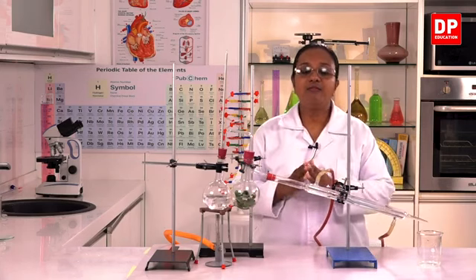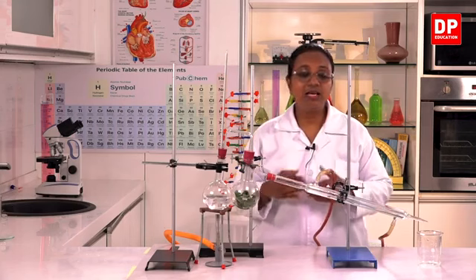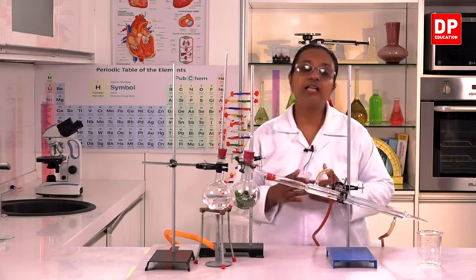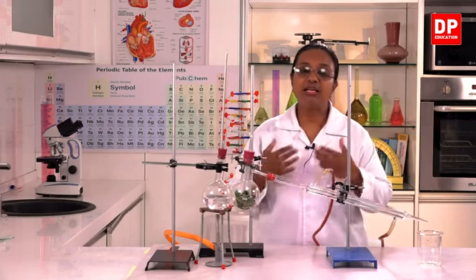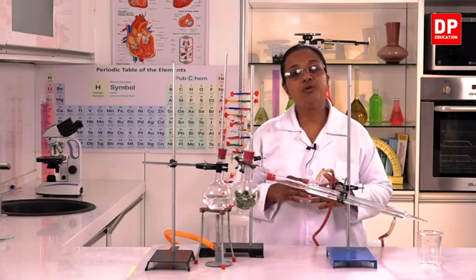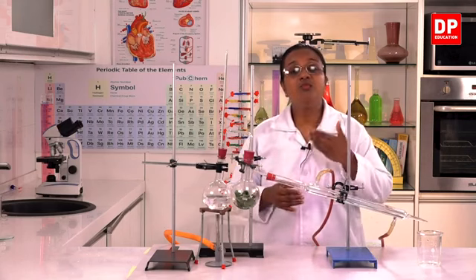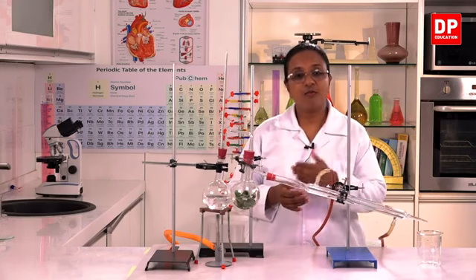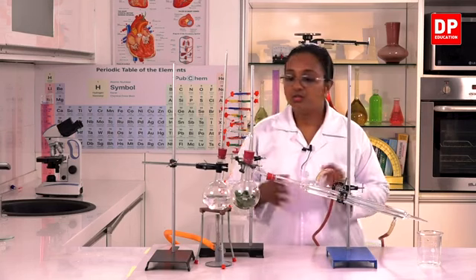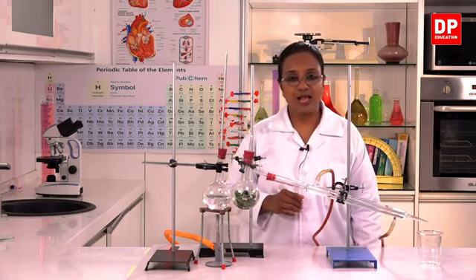So here we have to remember, students, that the cinnamon oil becomes vapor because of its high volatility. It's a highly volatile compound, so that means it can vaporize quickly and can be extracted. So as you already know, this process of steam distillation is based on the volatility of substances. Volatile substances are easily extracted using this process. So now that I have the setup ready, I will start the distillation process now.